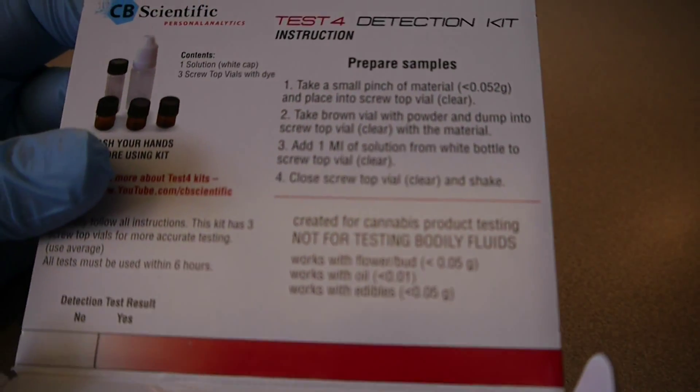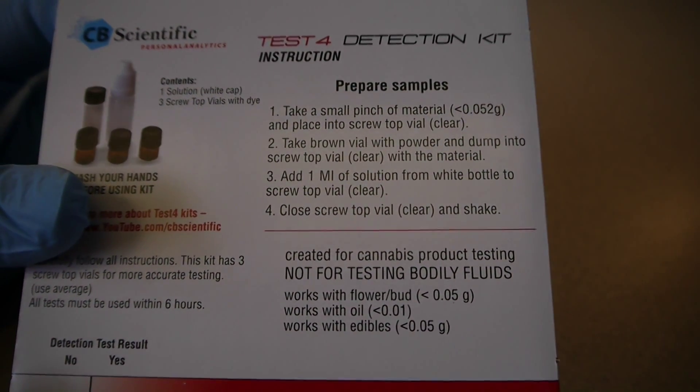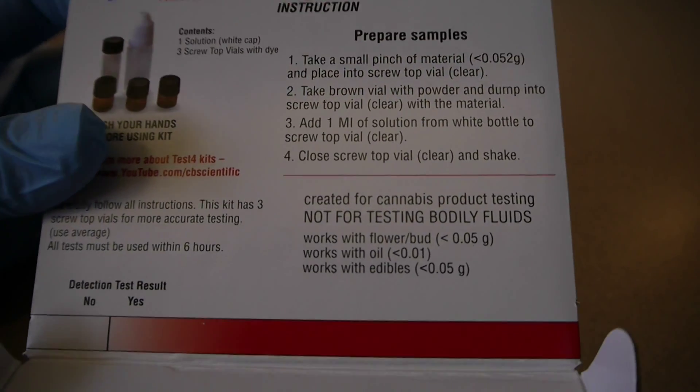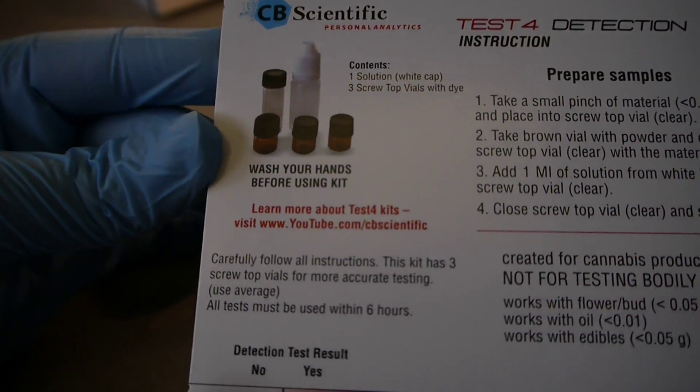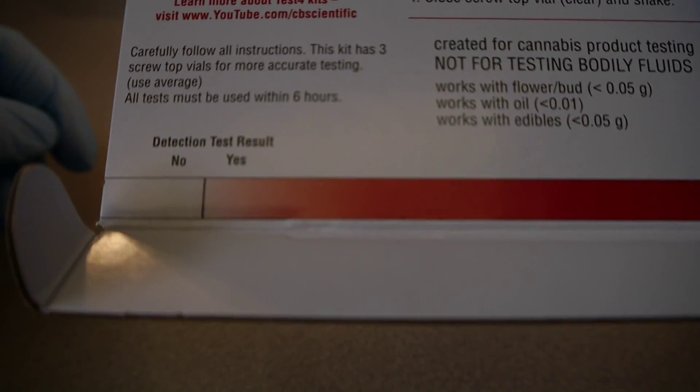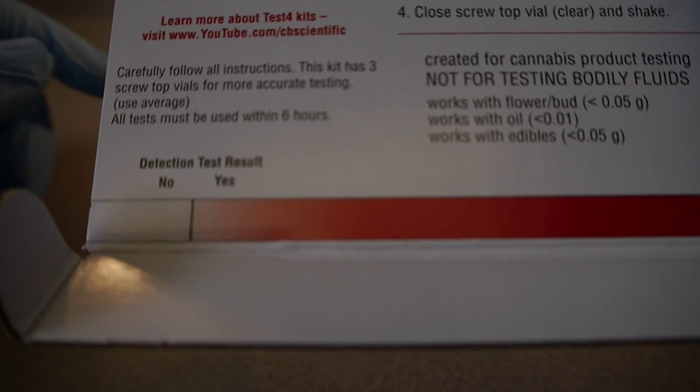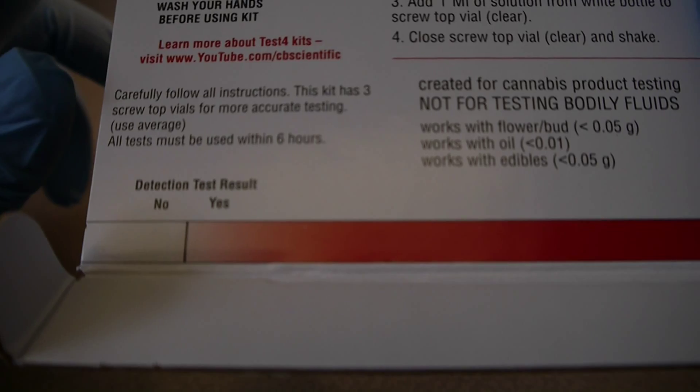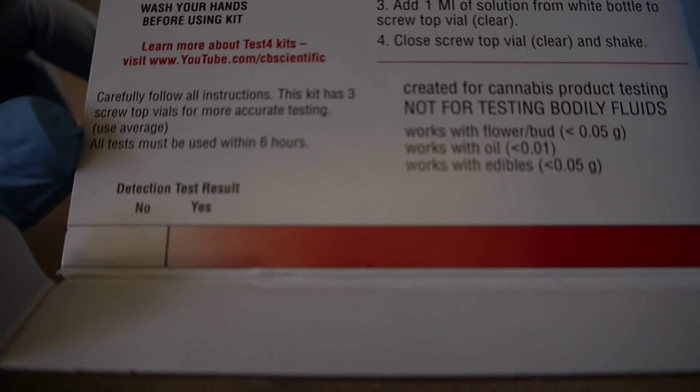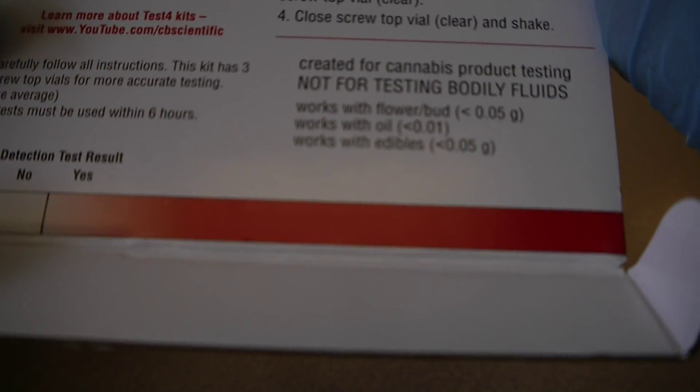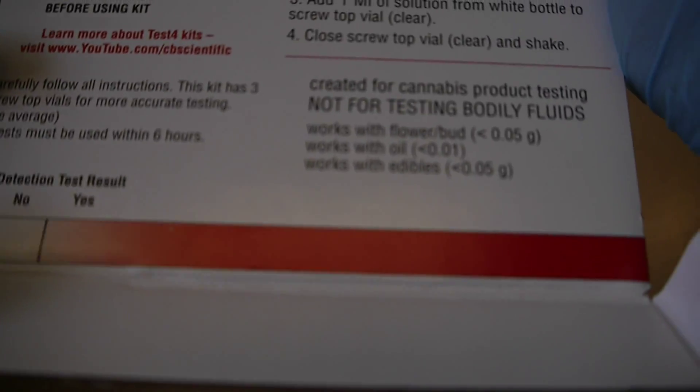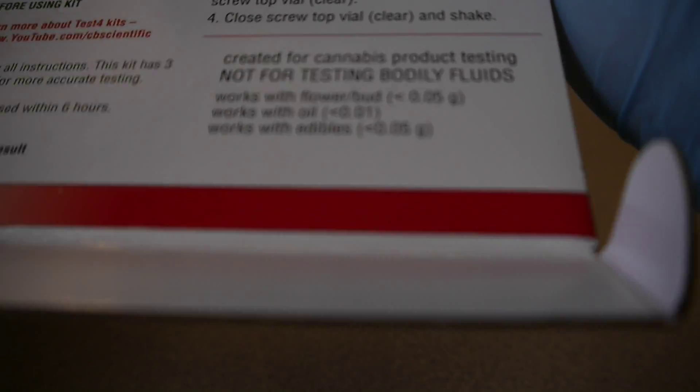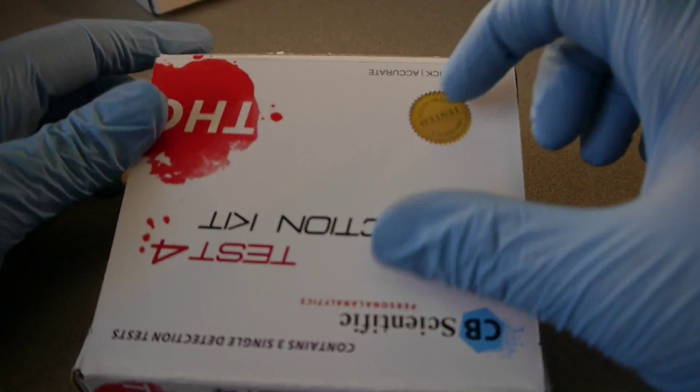Now let's get into some of the language down here. These are your instructions, as you can see. You can see how much to use right there. We can also see the ingredients up here. But again, the importance deals with this chart at the bottom. This is the detection chart. This says a no or a yes for a positive or negative detection. And as you can see, a yes will be any gradient of red all the way down to very dark red. So that is the THC detection kit.